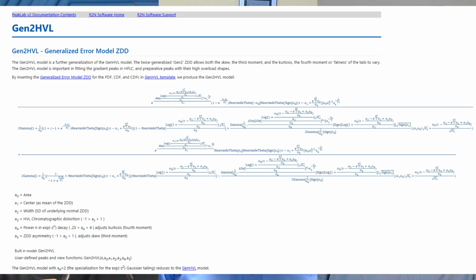It's not a lightweight kind of system. It's not something you want to go on and try to develop. We put the best of the statistical sciences together with the best of the chromatography sciences to produce the model. And all it did was add two parameters: a third moment, a non-ideality to deal with the skewness of your system, and a fourth moment, ideality to non-ideality, to deal with the compaction or compression of peak shapes arising from gradient chromatography. To my knowledge, this hasn't been addressed and it hasn't been published as yet.